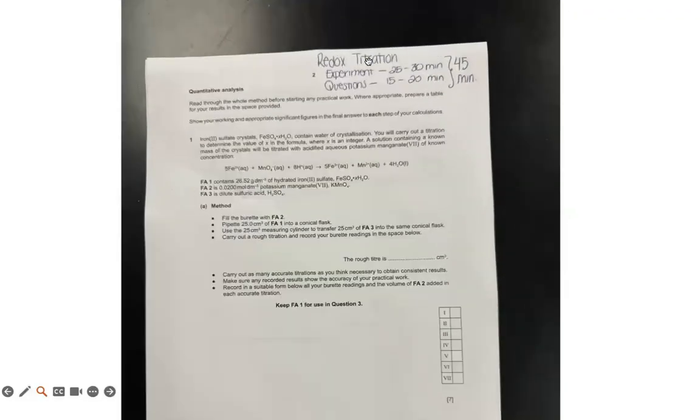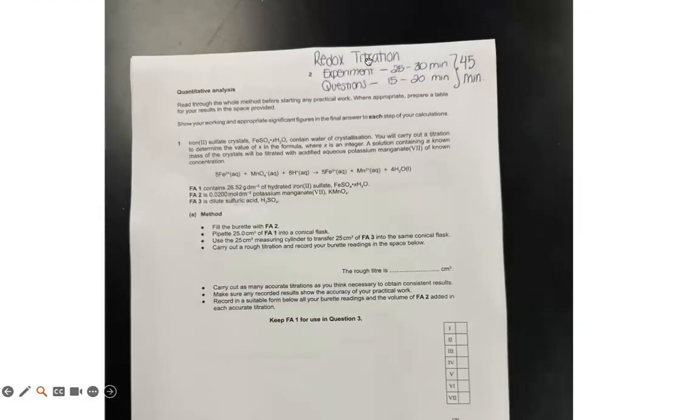This is a redox titration, so you don't want to spend more than 45 minutes on any question. Question 1 is typically the longest out of the 2 or 3 questions that you'll have. So the experiment should take about 25 to 30 minutes, and then the questions and the table 15 to 20 minutes.